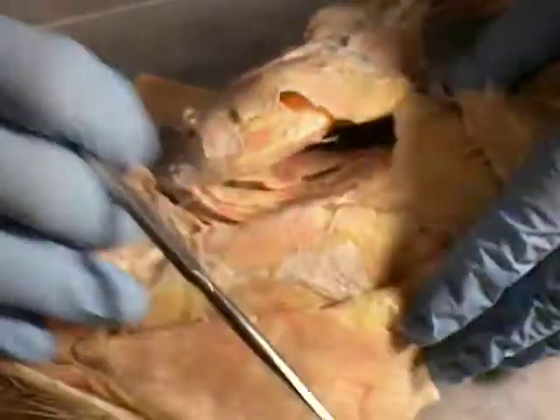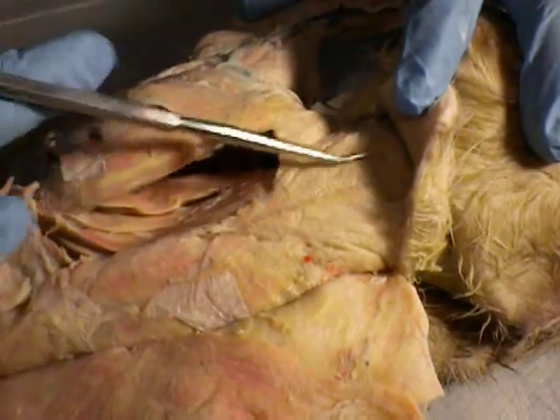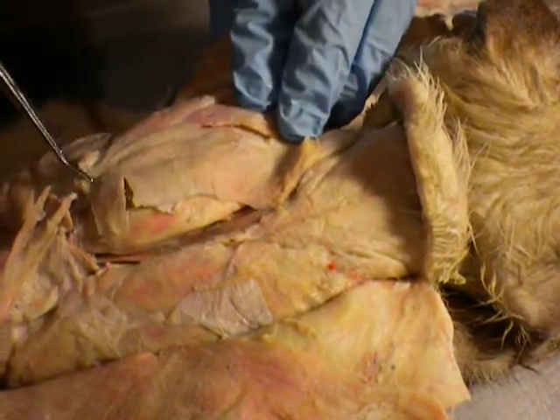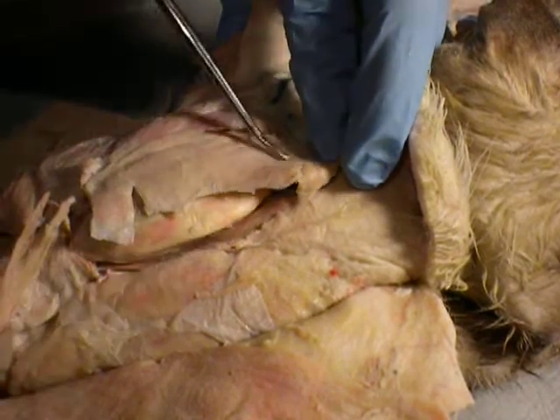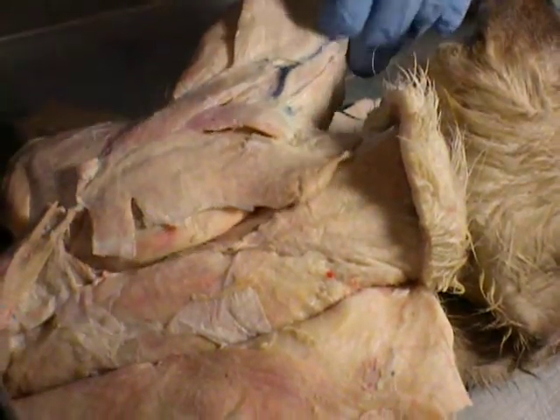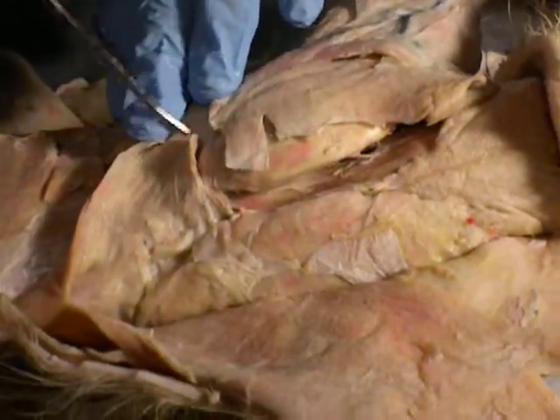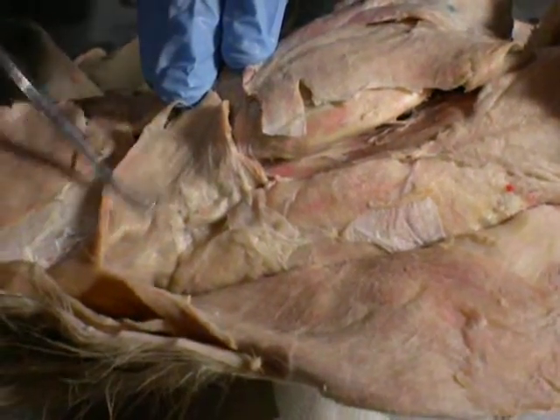Okay, onto the back and shoulder, clavotrapezius, acromiotrapezius, that thin muscle that covers the shoulder blade. This is spinotrapezius, which connects to the acromiotrapezius, but it goes in a little bit of a different direction.